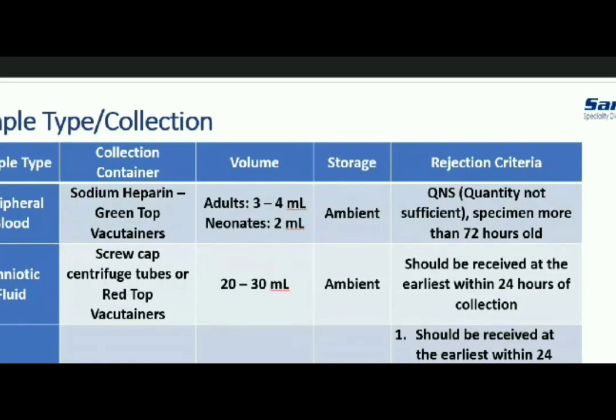When coming to POC, we always request the sample only in saline, not in formalin. This is very important, please listen. If we receive a sample in formalin, the tissue will be hardened. We can't slice it, we can't dissect it, and it won't be suitable. So I request everyone to please concentrate on this. The POC sample should always be received in normal saline only.